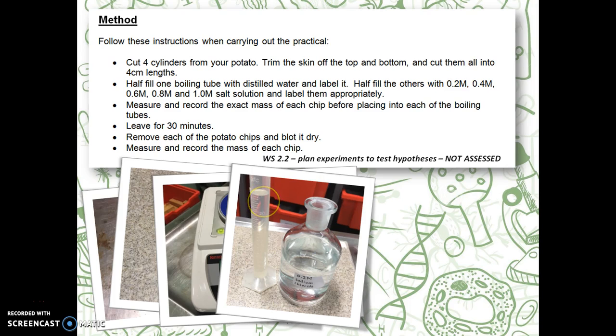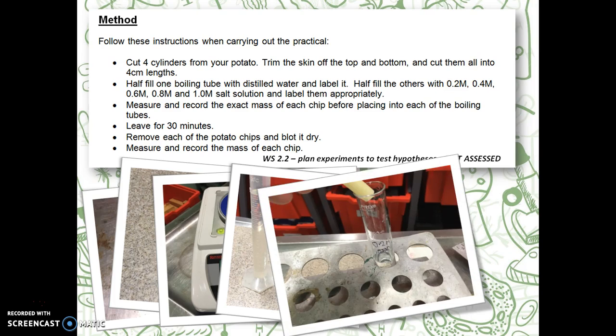And once we've done that, we can put the potato in the tube and make sure we start them all at the same time. If you left them longer, obviously more chance for osmosis, more chance for a mass change, so we want to make sure we're keeping that nice and fair. And you notice it's nice and clearly labelled with the solution and some initials on it to make sure you know what you've got in it when you come back.